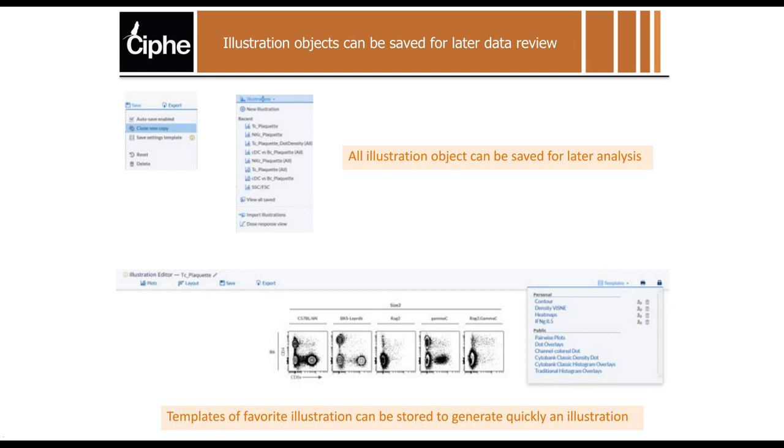The last thing I wanted to show is, because I've seen lots of colleagues that don't do that too, if I can bring that, there are ways to save your illustration. So you can really design several different illustrations that you plan to show to your colleagues. You can save them and then show them later during a TC, or allow your partners to actually go and consume this visualization that you have prepared for them.